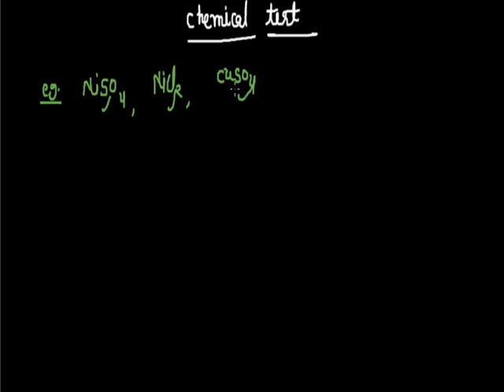So we always analyze the anion first, never the cation first, since there are some anions like fluoride F-, borate BO3 3-, and oxalate C2O4 2-. These three are called interfering radicals.